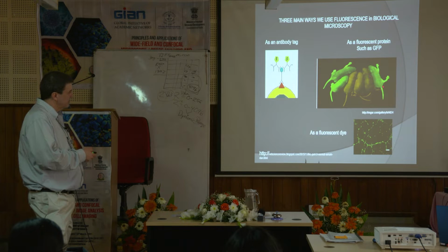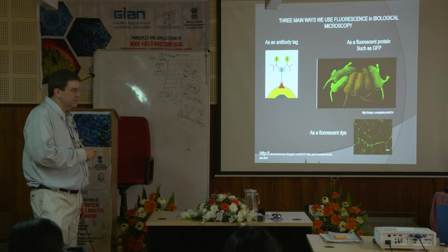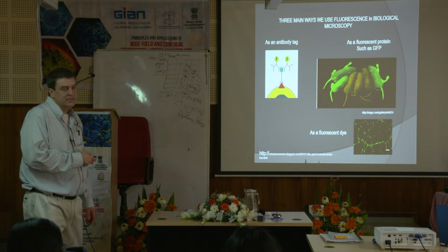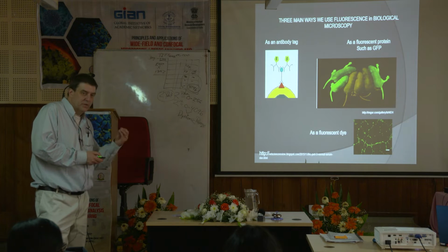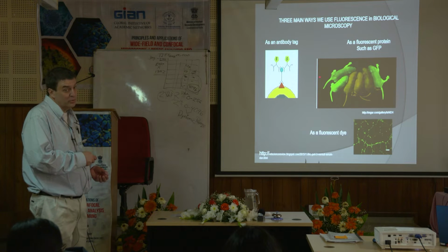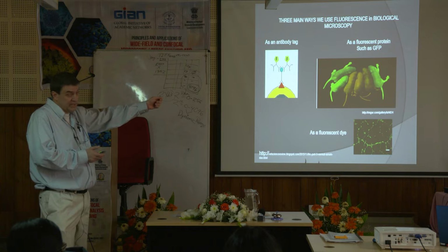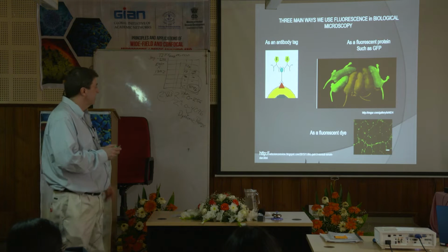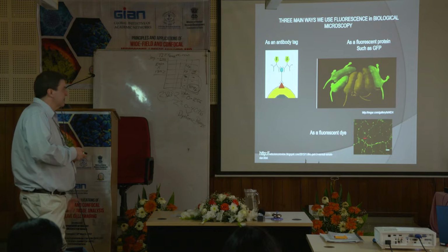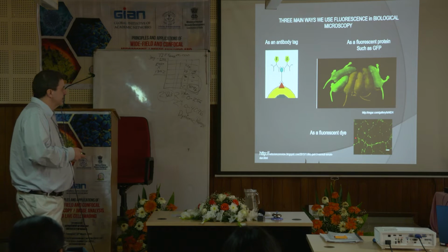GFP, green fluorescent protein, which we talked about the first day. Dr. Nair's talked about green fluorescent proteins. I will get into more detail about this when we talk about live cell imaging. The fluorescent proteins are the heart of live cell imaging. So we'll talk about that. And if you've never seen a green fluorescent mouse, they're pretty cool. Let me tell you. You take the black light, you shine it over them, and they're green. It's like, wow, it's something to see. Because we have them at our institution. It's pretty neat. Sort of like a firefly, except the whole thing's lit up green. It's pretty weird. Or as a fluorescent dye.